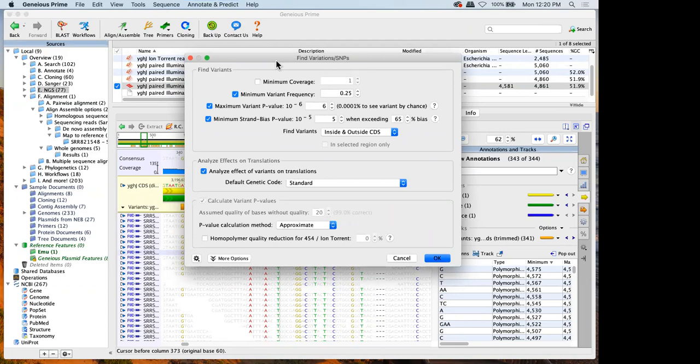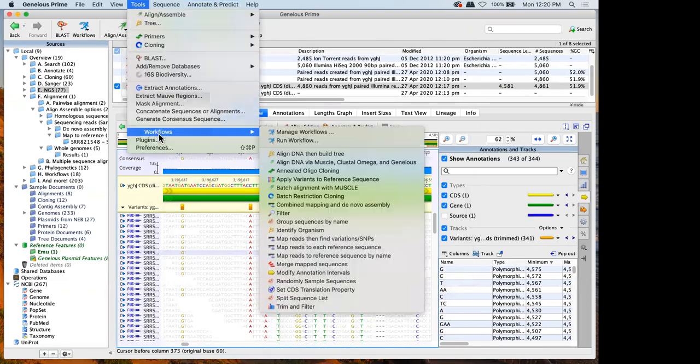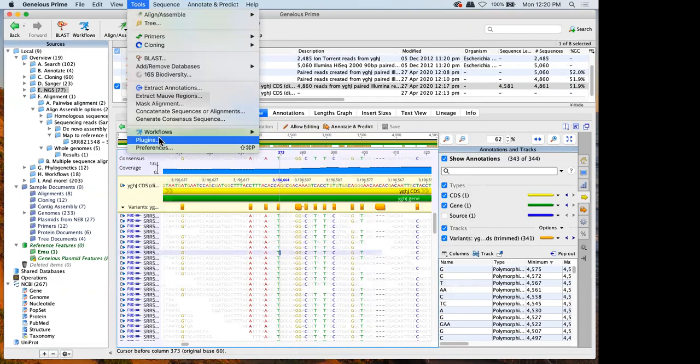And so, maybe you mentioned that Freebayes is included as one of the algorithms. So these are the 2 tools you can use basically to call variants? Yes, yeah. Okay, thank you.